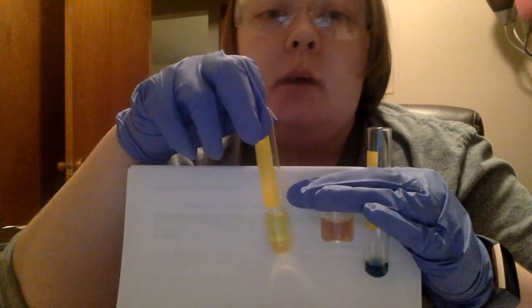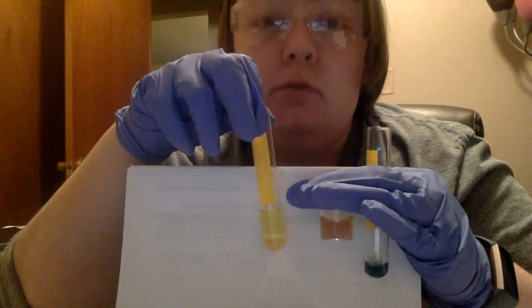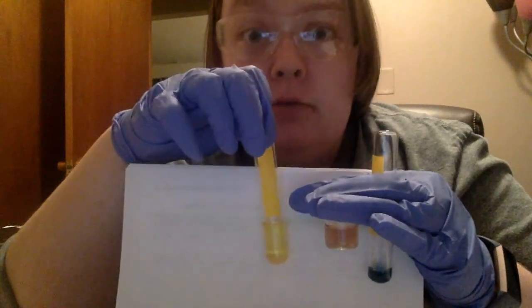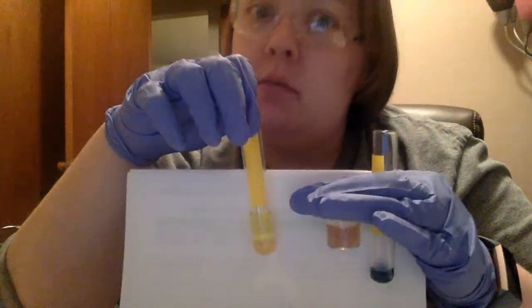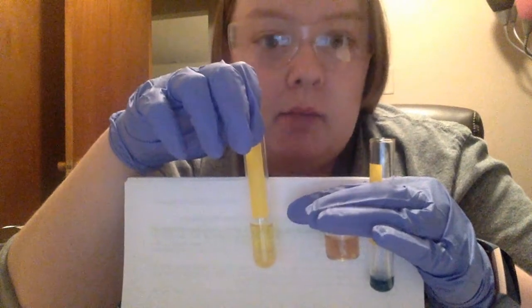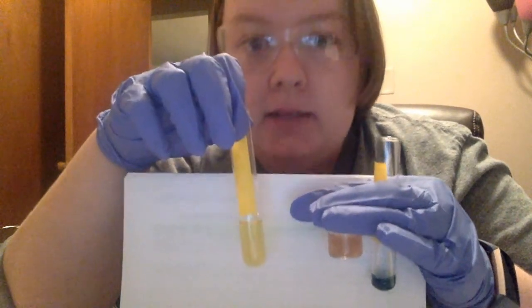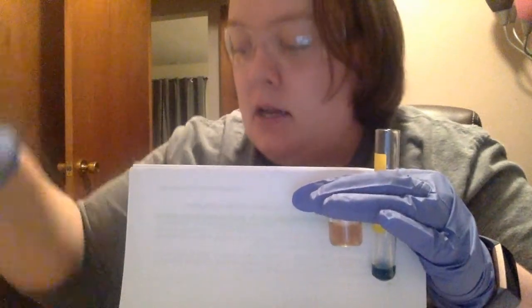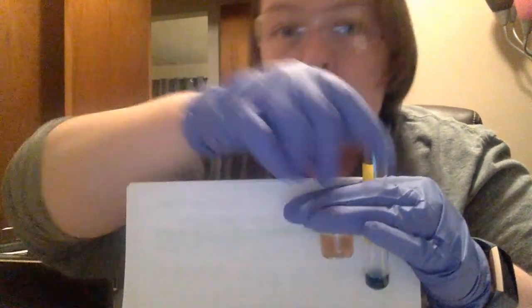Now the reasoning behind putting this one in a special little vial is because when I saw it come out, my mind said, oh, ruffinotoxin is red. This looks like it might have something in it that could be red. Let me collect that because we're going to want to further analyze it. So we have no confirmation yet that this pink one is a ruffinotoxin.